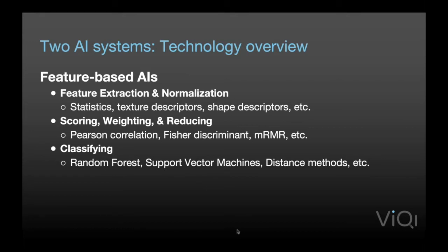And that's feature extraction. You run your image through dozens of these algorithms. So then in the next stage, which again we kind of saw in the neural network layout, is the coordination of these features they're assembling. In this case, we want to figure out which ones are important, which ones aren't, right? And that's kind of equivalent to the weights that we have in the connections between the neurons. And there are different algorithms for that. So these are, again, individual discrete algorithms that give you a score for how good each feature is.